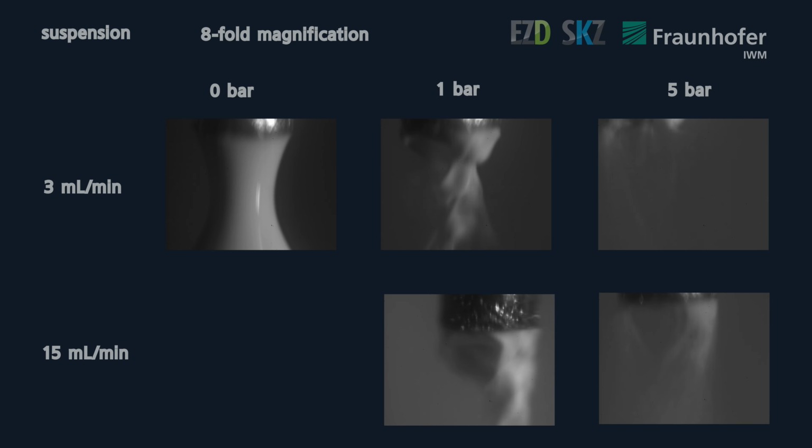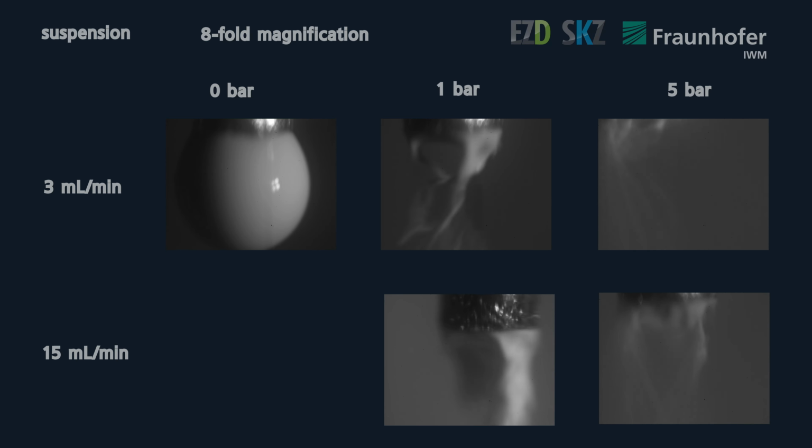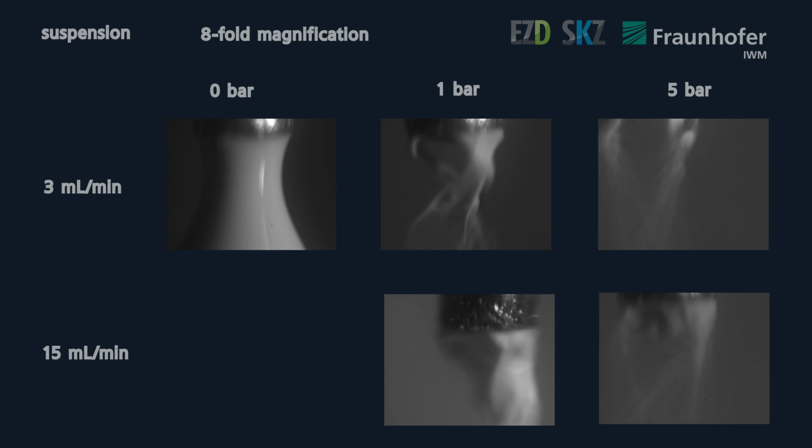Even with the higher magnification lens, we were unable to detect individual droplets in the pressurized system, only finding connected water droplets. However, we must emphasize that this is an artificial system and cannot be guaranteed to represent flow states in a spray dryer. In fact, the spray dryer contains more equipment, such as an atomizer, which impacts the flow dynamics.